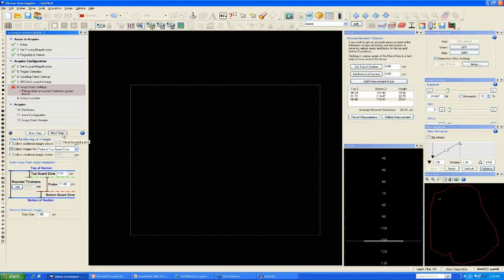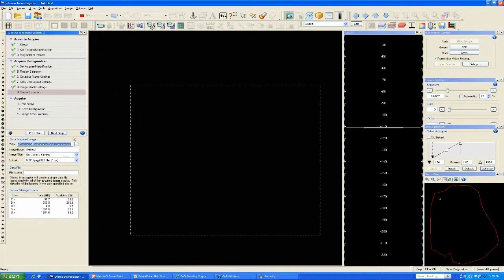The final step, or step 9, directs the user to choose a location for saving the data and image files. So we have already entered a path here for a folder on my desktop. The next option is to give each of the images in your series a base name. This makes it easier to go through and find a specific image, even an image that is part of a Z-stack later on.